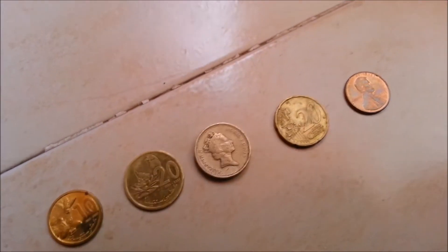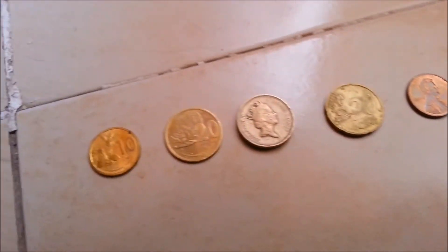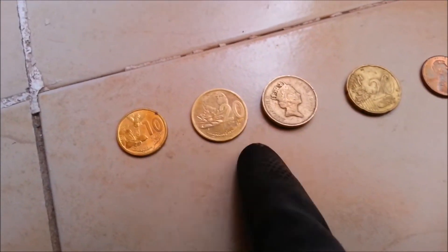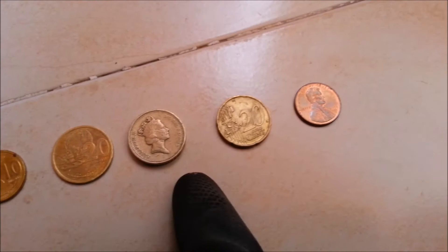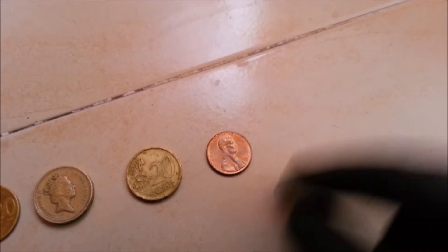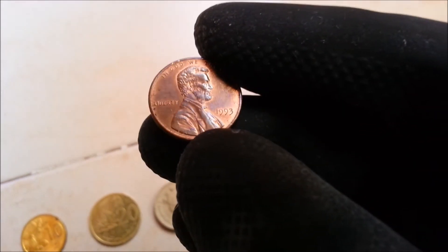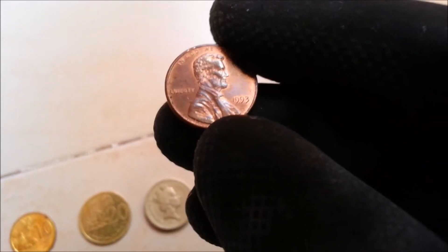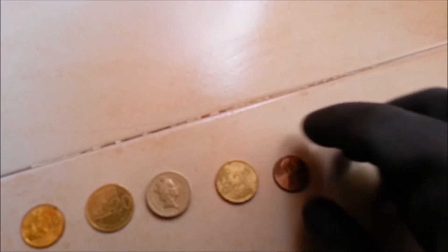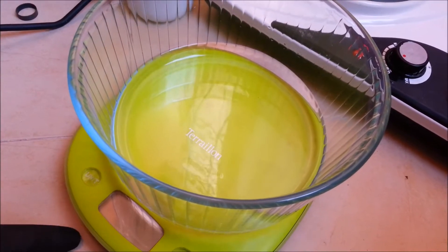First of all, what we're going to need is some coins — some copper coins. We have here five coins from different countries: two different coins from Morocco, one from England, one from Europe from the 90s, and this famous one from the United States made from copper from 1993. We can see it's clearly made from copper, and we can even see the face of Lincoln. Now we need about 100 milliliters of water.